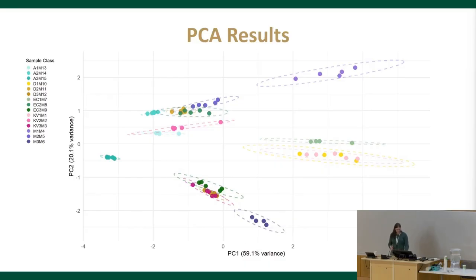Interestingly, the groups of mead brewed with the Abbey yeast actually formed their own separate group over here. We can see that the groups of mead brewed with the Abbey yeast and 1.5 pounds per gallon of honey and 3 pounds per gallon of honey are very close to the overall 3 pounds per gallon group, but based on their positioning on the plot, it's relatively clear that the groups of mead brewed with the Abbey yeast had a more distinct volatile profile, at least one not as dependent on honey concentration.